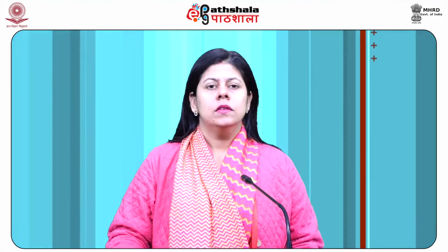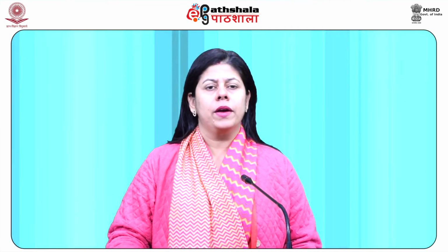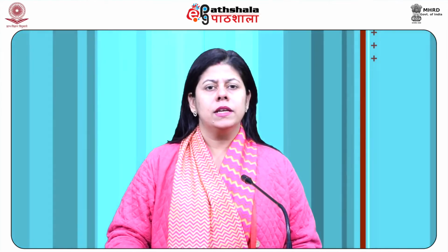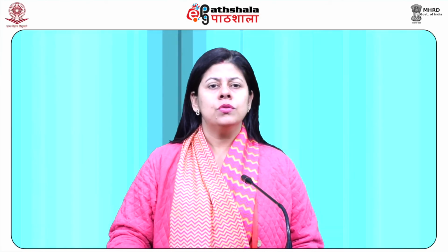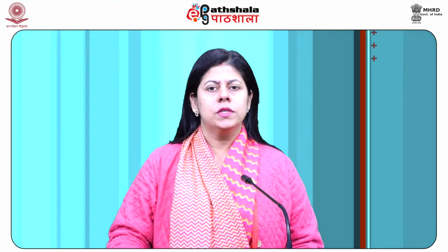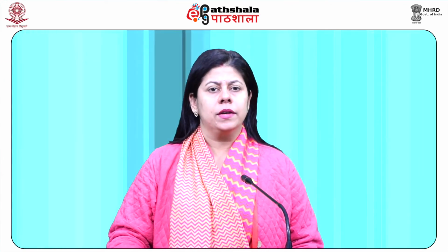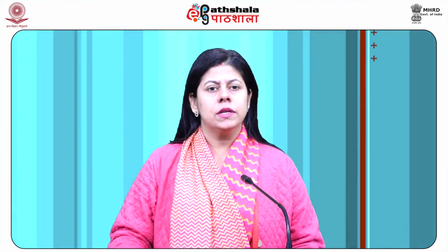Stereo microscope. The stereo or dissecting microscope is an optical microscope variant designed for low magnification observation of a sample using incident light illumination rather than trans-illumination. It uses two different optical paths with two eyepieces and two objectives in order to deliver slightly separate viewing angles to the left and the right eyes. A three-dimensional image of the sample is produced in this way.